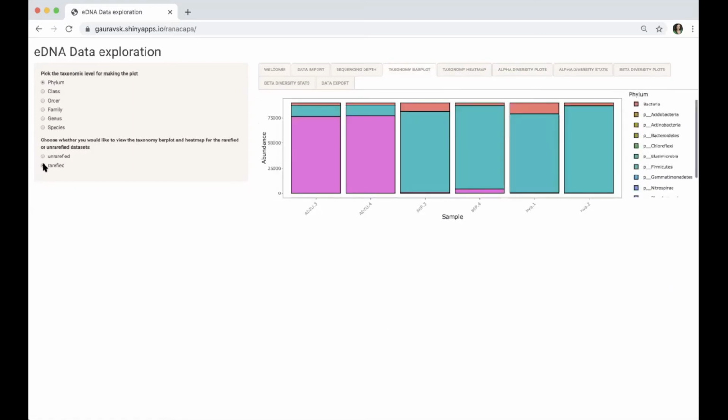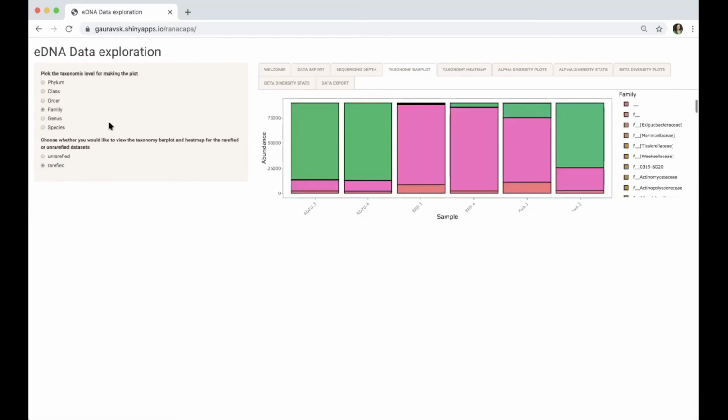And let's go down to the family level. So black-eyed peas, even though they seem to have had the highest total richness of everything, of all of our different samples, they're very highly dominated by one type of bacteria, this Staphylococcus. It makes up almost 100% of these samples.